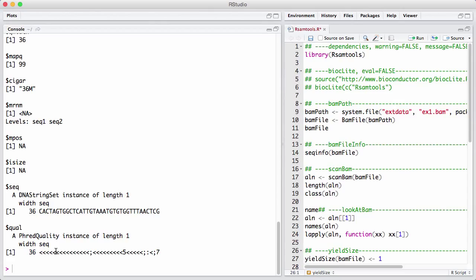In the example we're showing here, we're going to see some reads that are aligned directly to the genome, and we're going to leave out these more complicated representations. If you are going to work with spliced alignments, you really want to look at the GenomicAlignments package that contains classes for representing spliced reads. Okay, back to BAM files.